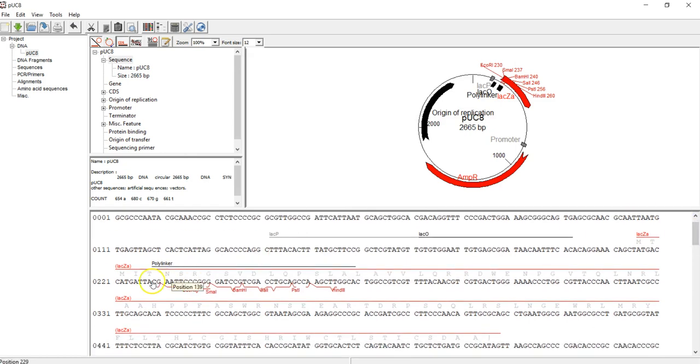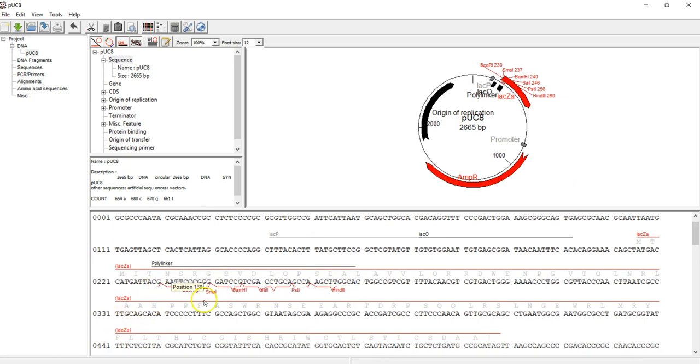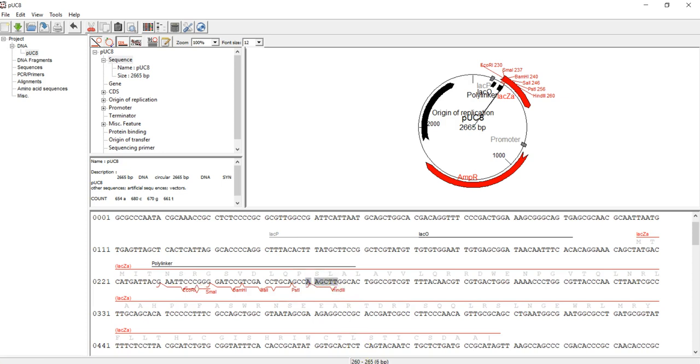You can see within this polylinker region, these are the restriction sites. For example, HindIII—so HindIII is the enzyme that recognizes this sequence from here. Six base pair recognition sequence is AAGCTT.